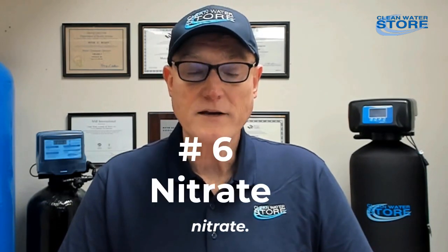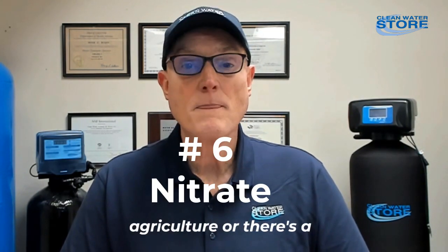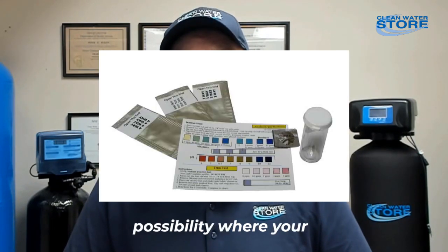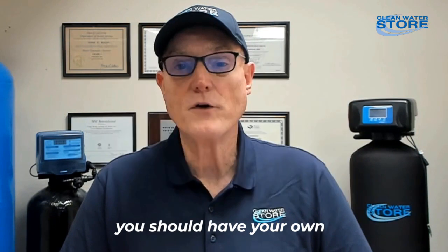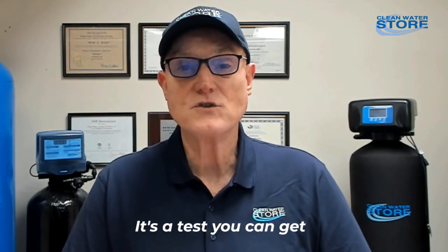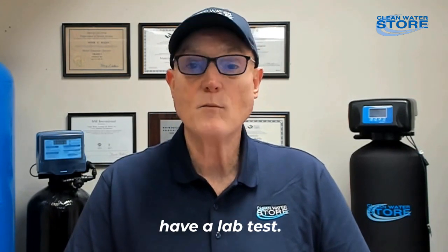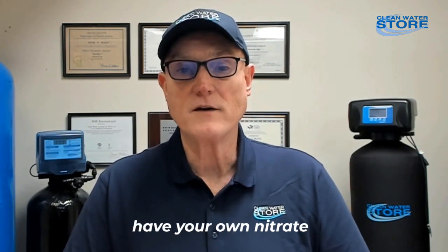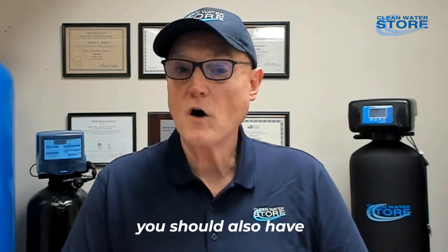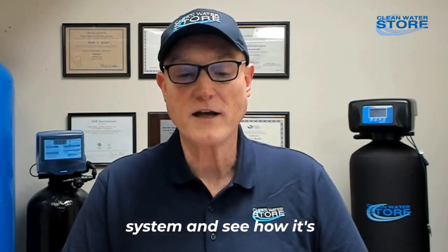Number six: nitrate. If you're in an area with agriculture or there's a possibility your groundwater has high levels of nitrate, you should have your own nitrate test kit. It's a good idea to have a lab test done, but if you have a nitrate problem and your own nitrate filter system, you should also have a home nitrate test kit so you can test before and after your nitrate system and see how it's working.